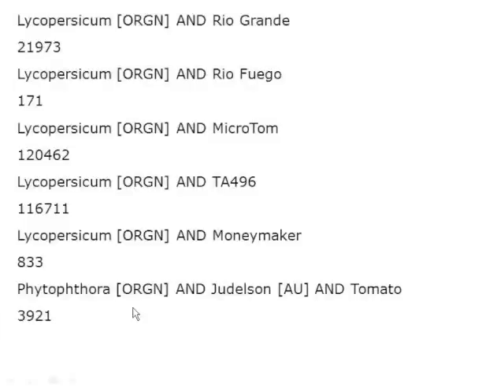This slide summarizes the results of using the grep file on a number of different sets of data. Each of these represents a set of data that we can now compare to the piece of DNA that we pulled out between our flanking markers.